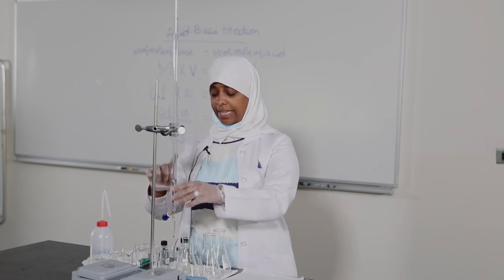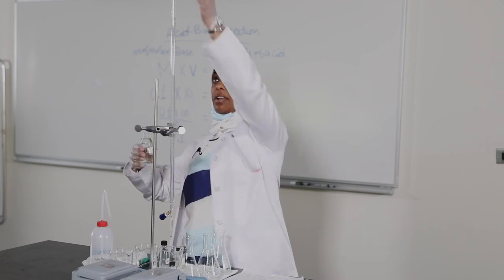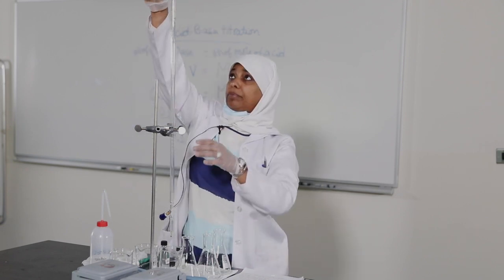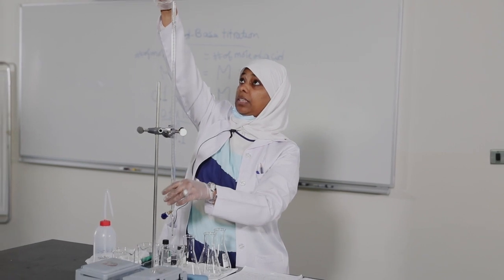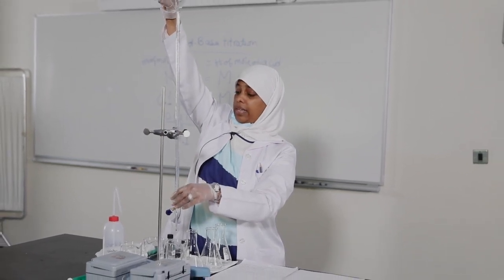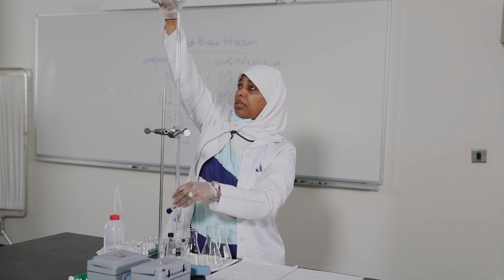After making sure we have cleaned the burette with distilled water, we fill it with NaOH. We start filling the burette from zero to fifty.